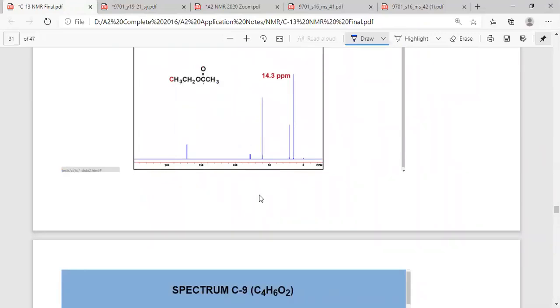This one, of course, the carbon here is this one here. This carbon. Okay? Right? Now there's 1, 2, 3, 4. Okay? 1, 2, 3, 4. This will be the last one because it's the furthest away. Alright? Okay? This one is next to the oxygen. It's next to the carbon. So the one next to oxygen will be this one. Okay? This one here, next to the carbon. Carbon is this one.